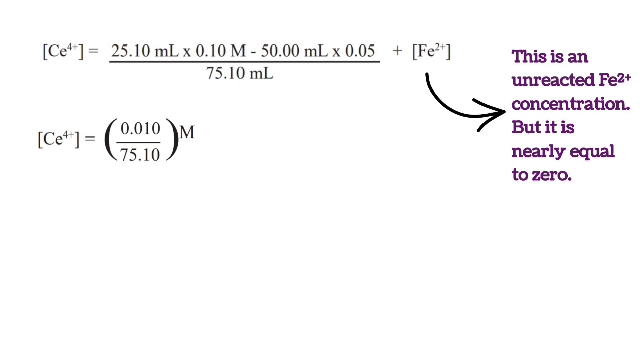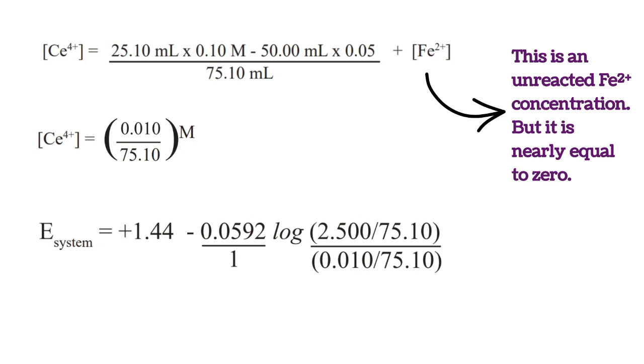According to the Nernst equation, the potential of the system can be calculated.